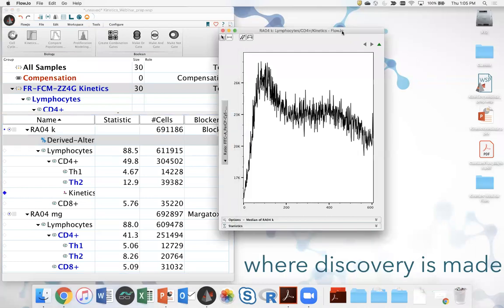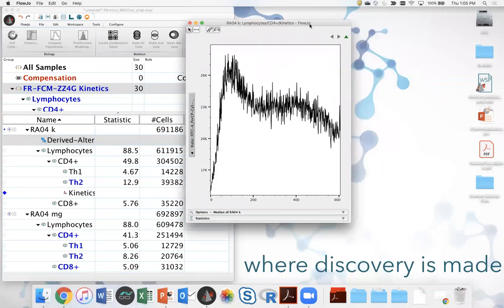So anyway, I've opened up one of these kinetics analyses. I have the ability at the start to choose three different means of applying ranges to the data. I could hand draw a series of range gates. I could specify how many I wanted and adjust thereafter, and I could hit auto to attempt to auto gate this.